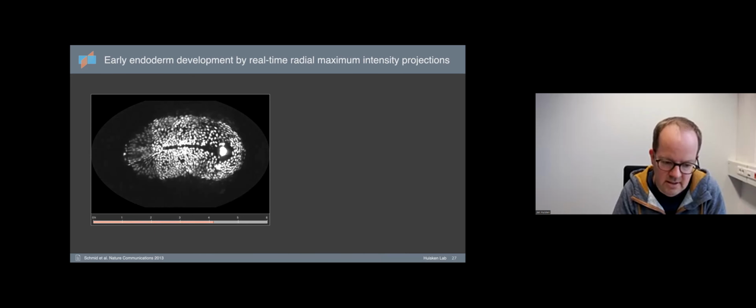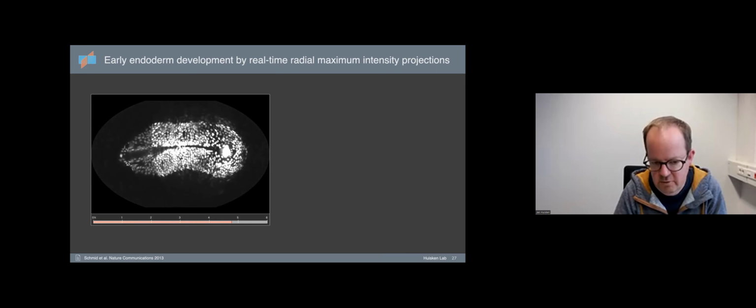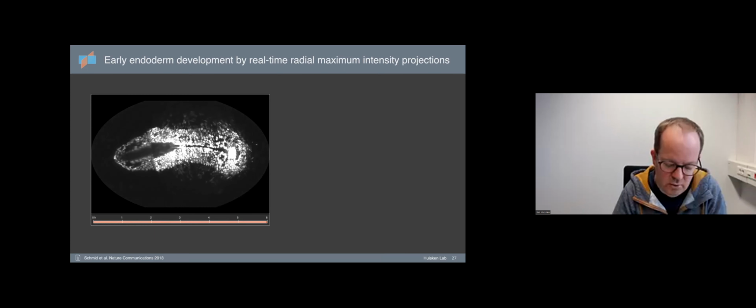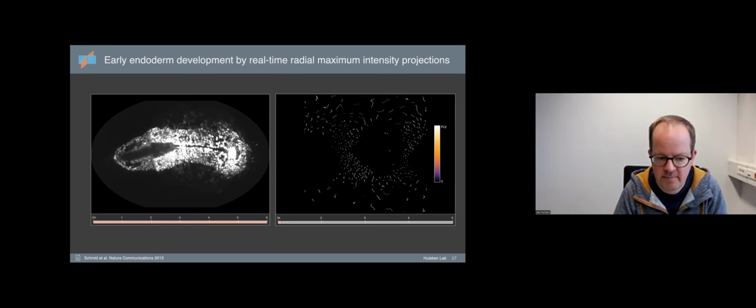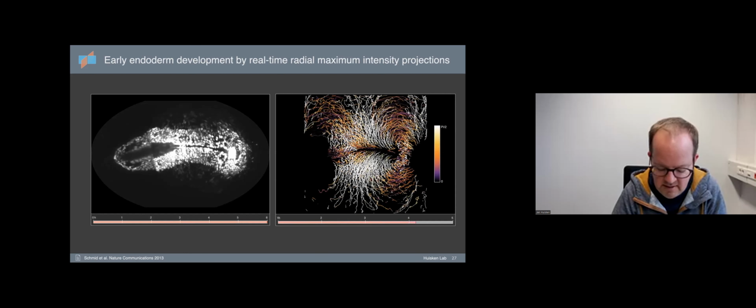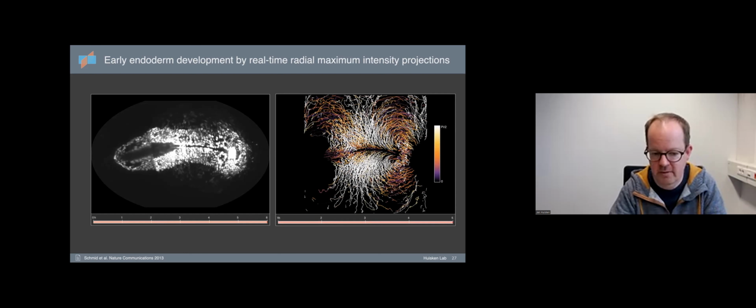And so, of course, there's a number of assumptions made, but critically, this is a way to compress the data so efficiently that visualizing the data becomes a lot easier, or further analysis becomes a lot easier. But most importantly, you can go on and image the next embryo right after this experiment, right? So you can do more high throughput imaging, if you will. That is ultimately needed if we wanted to compare these cellular patterns in different embryos.